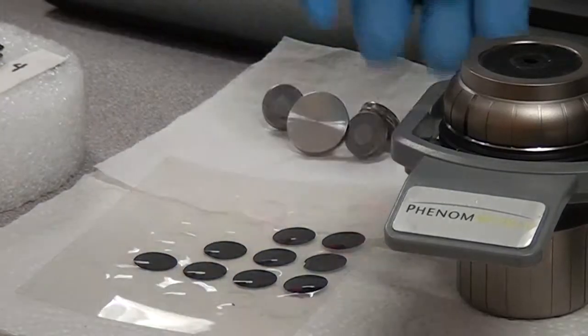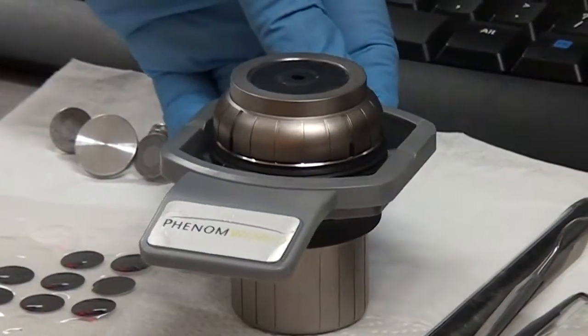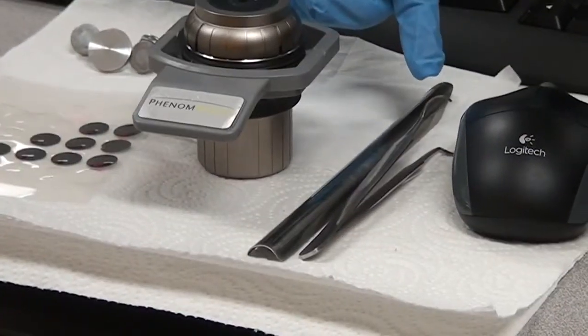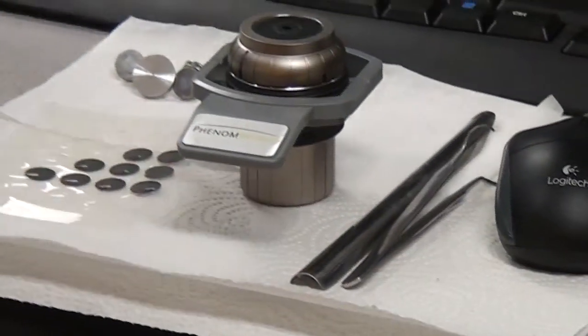The stub is then placed on the sample holder using special tweezers, and then once we have the sample on the holder, we insert it gently into the sample chamber for analysis by the SEM and EDS.